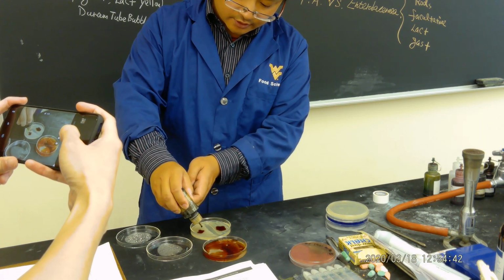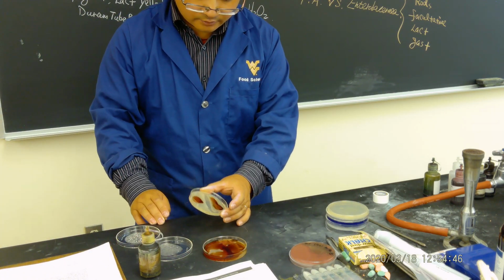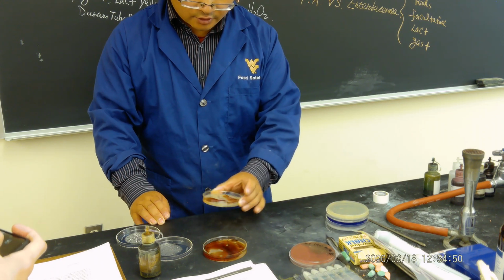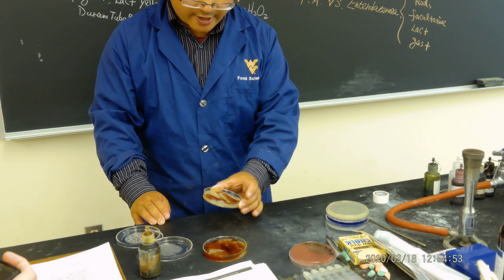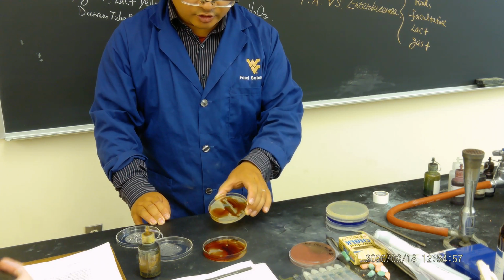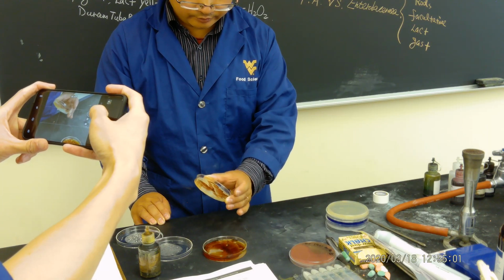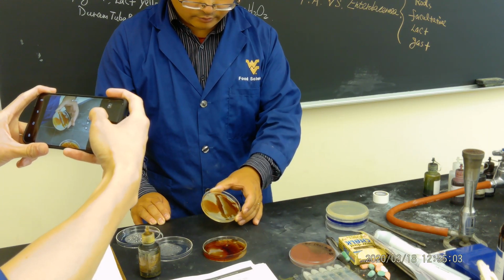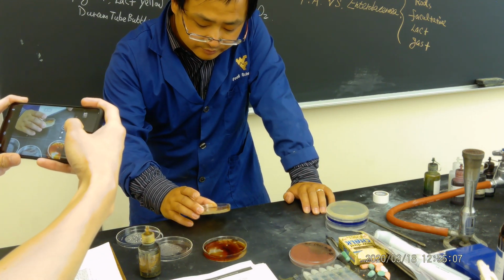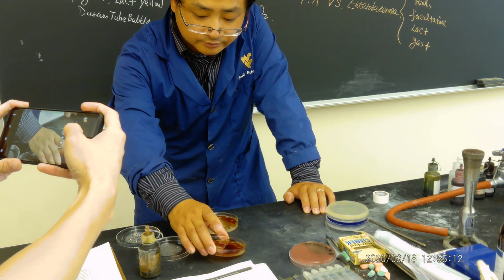We pour the iodine here. We mix it. You should be seeing the starch reacted with this, and one side will turn a brownish color and the other side will not. So it seems like from here it's not very obvious. I didn't see which side turns a brownish color and the other side does not.